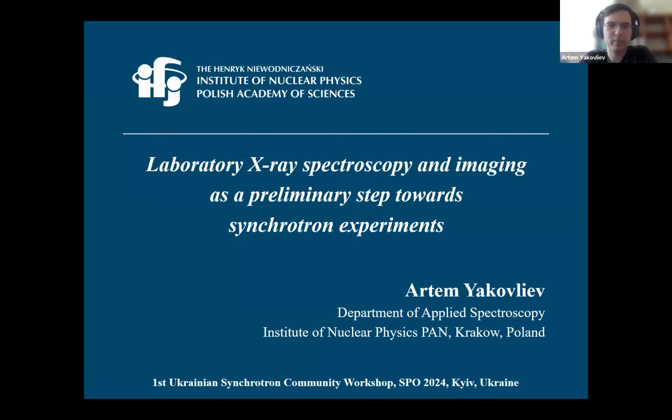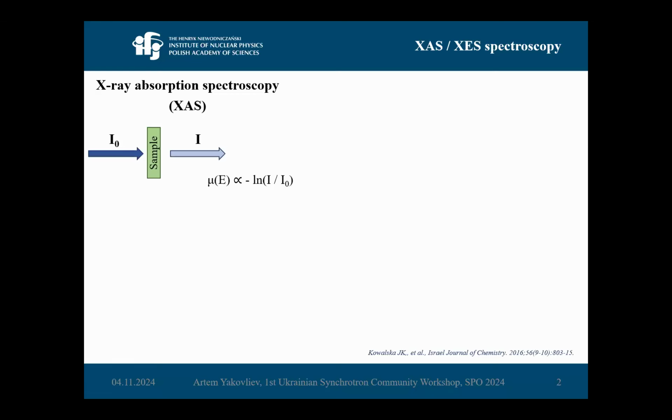Figuratively speaking, a step back and talk about what kind of experiments you can do before you go to the facility, to the synchrotron or XFEL. So luckily for me, I had the introduction already given by Katarzyna and Alexei. So I will just briefly mention here what XAS and XES spectroscopy are, and I will be mostly talking about them.